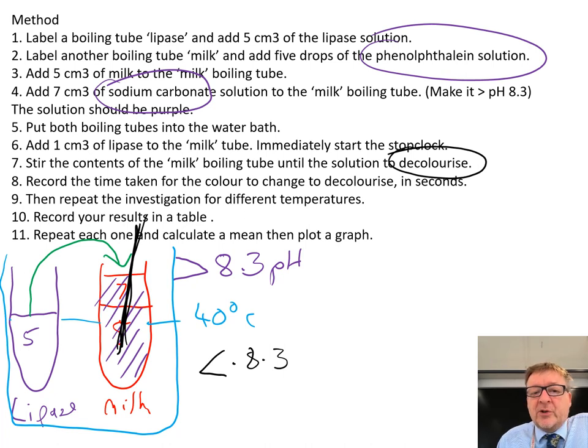Repeat the investigation for different temperatures—you might do 30, 40, 50, 60, 70, 20. Record your results in a table. The best way to continue this experiment is to repeat each one, maybe do each one three times, calculate a mean, and then plot a graph.